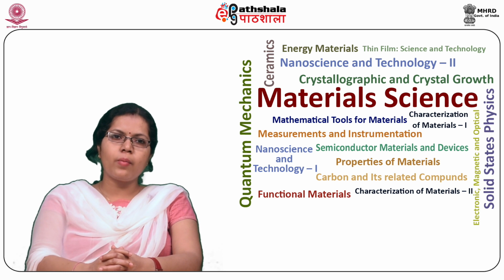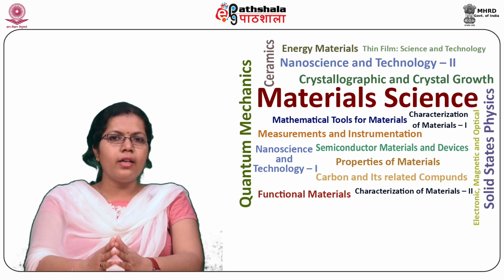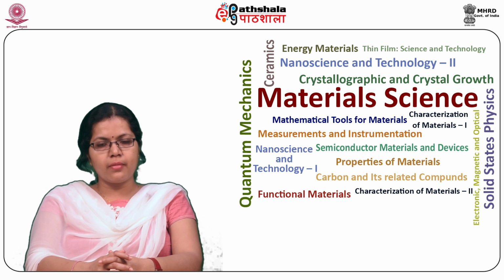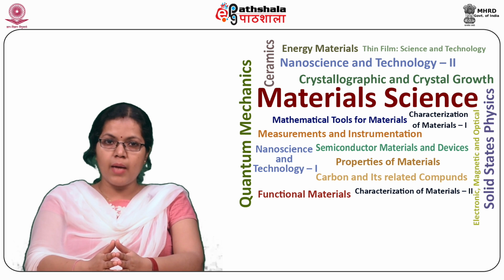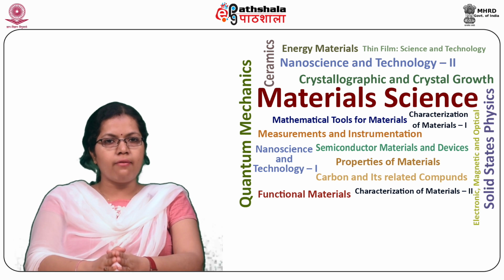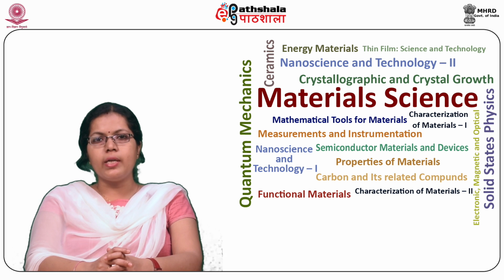Students, the third instrumental component is the cuvette. A monochromator source is used. Before reaching the sample, light is divided in two parts of similar intensity with a half mirror splitter. One part, or sample beam, travels via the cuvette having the solution of the material to be examined in a transparent solvent. The second beam, or reference beam, travels via a similar cuvette having only solvent. Reference and sample solution containers have to be transparent towards the passing beam.